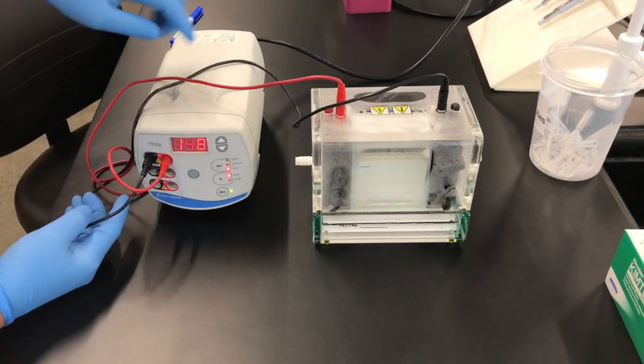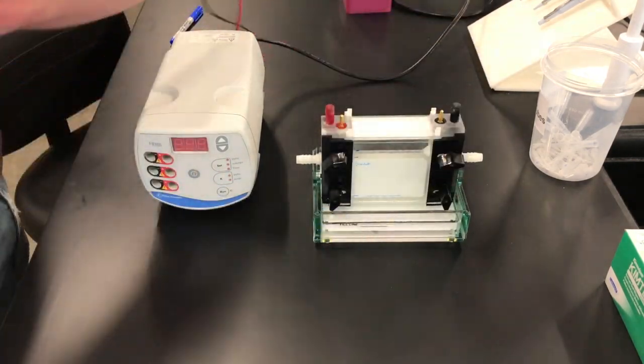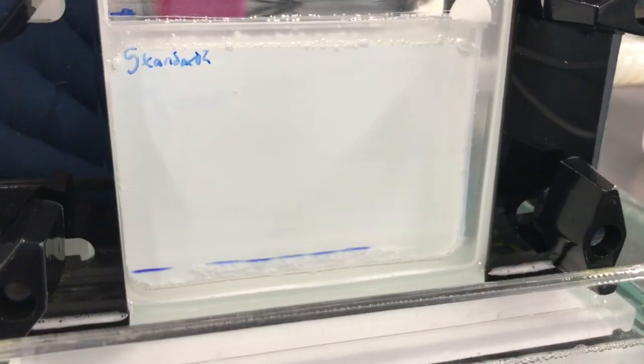Once it's done, go ahead and turn off the power supply, unplug all the cables, and remove the top cover. The sample should have run so that the dye is about one centimeter from the bottom of the gel.